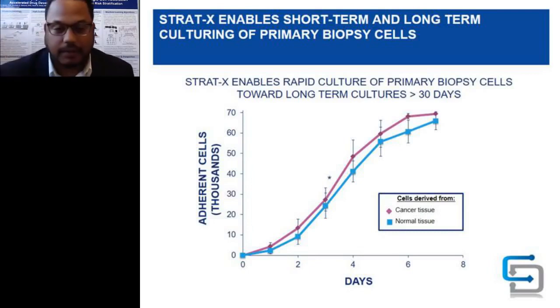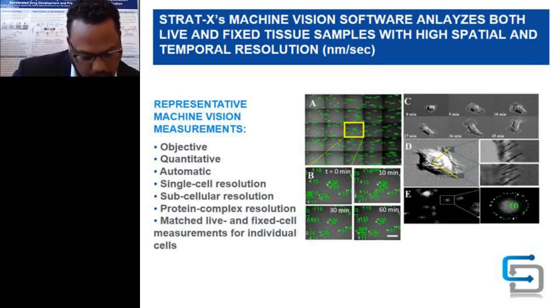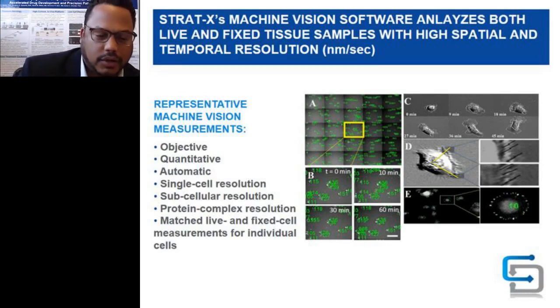So now that we have the cells alive, we certainly want to make sure that we can objectively measure them and quantify important biomarkers or features or behaviors of these cells. And I think it's important to note that the objective nature of this quantification is kind of critical to the next steps of the platform.